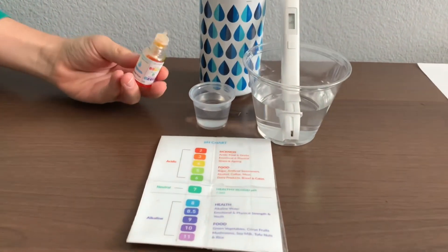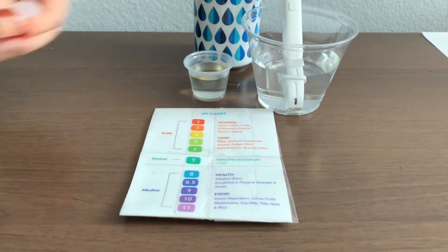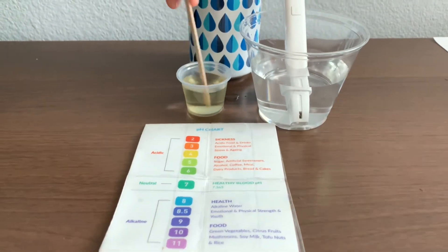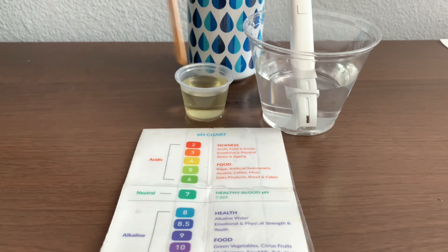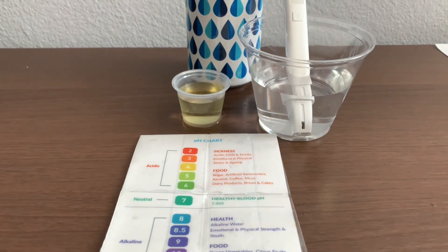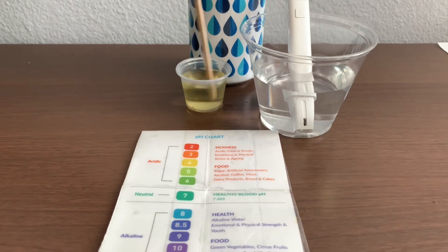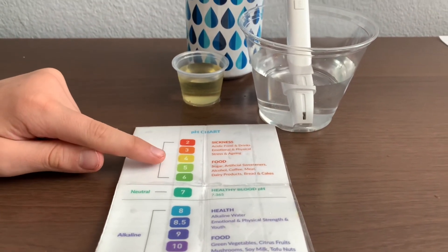Now, let's test the pH level. Only do two drops. Let's stir it a little for a better result. I'm going to add one more drop for a clearer color. Let's stir it a little more. I give this a 4.5 — this is acidic.